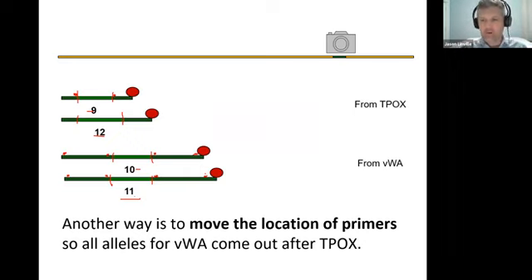All right. So just visual, when you order the primers to amplify an area of DNA, you can put your primers close to the area of DNA. It's going to get amplified. You're going to be able to measure it. Or you can put the primers farther away from the DNA, and you're still going to be able to amplify it. Okay, so how would this look?